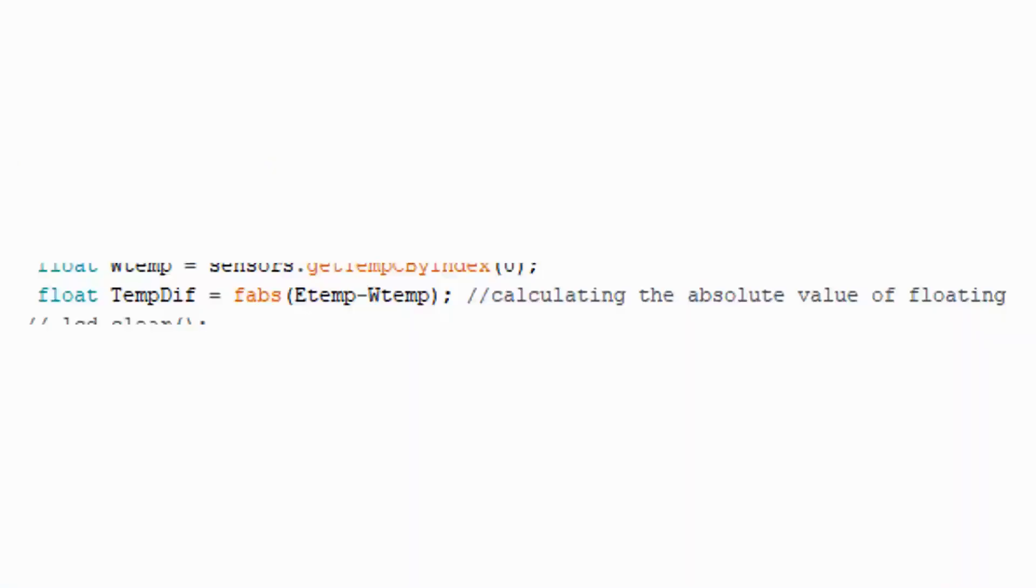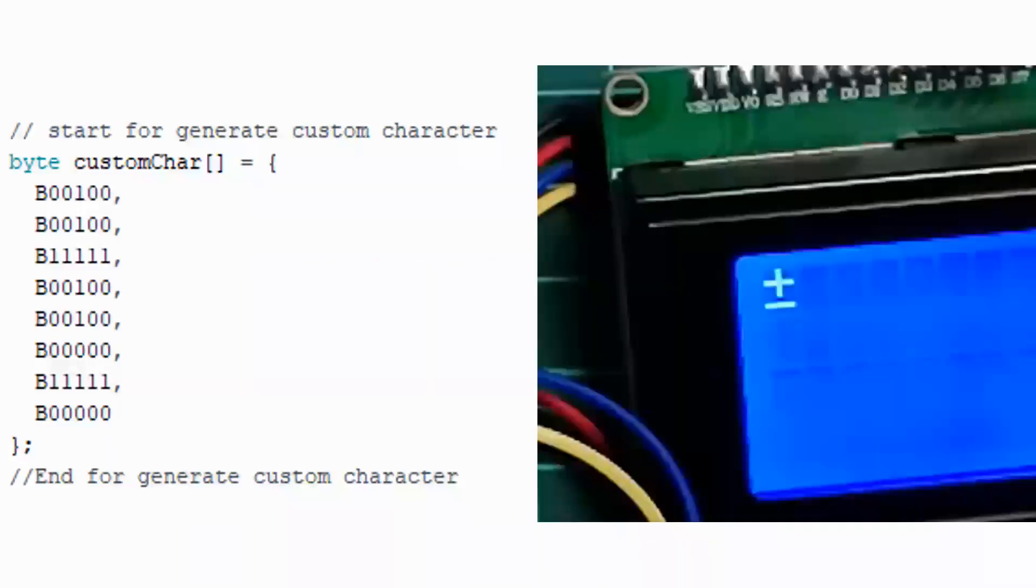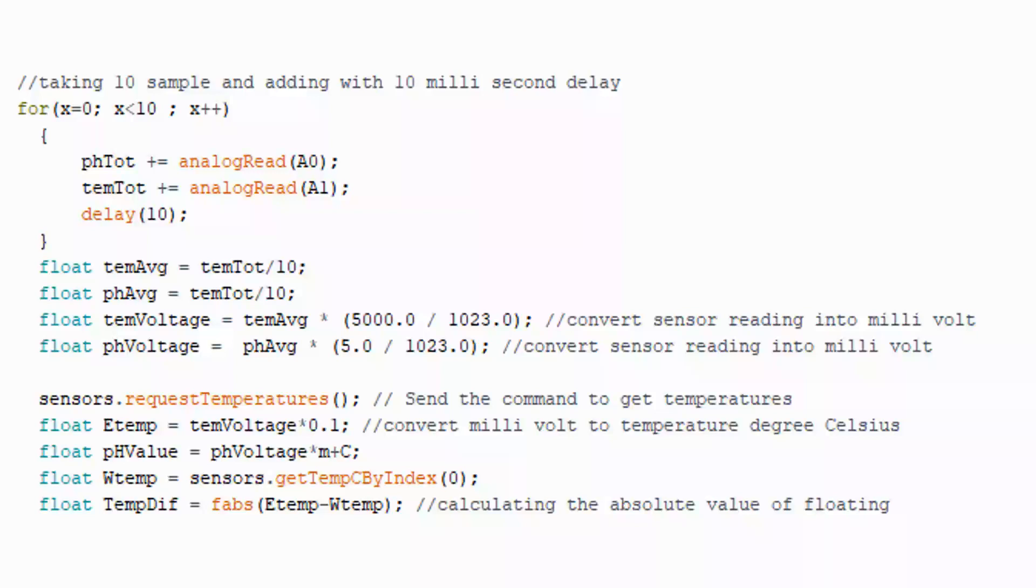For working of this code, include math.h is not necessary as it is already included by default. But here, for demo, to show the working of f abs, that is floating point absolute value, we are including it. So, using or not using this library won't affect your code. In software code, we also generated a special character for plus minus. This software code basically takes 10 different readings at fixed interval of time and calculates average. The average value is further converted to voltage and then pH using formula of a straight line.